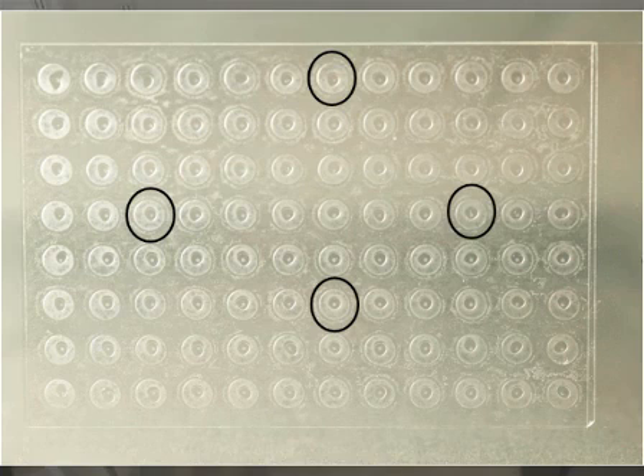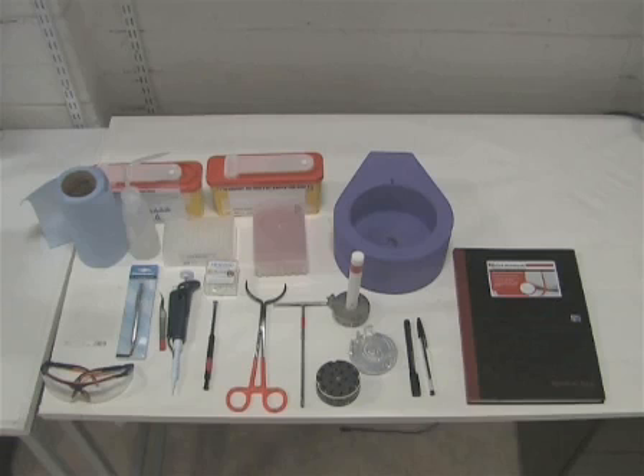Wells containing crystals are marked legibly. A glass cutting tool for opening crystallization wells, tissue and a water bottle, curved tweezers, precipitant screen solution, a micropipette and tips, and cryo-loops for harvesting crystals, and a magnetic wand.